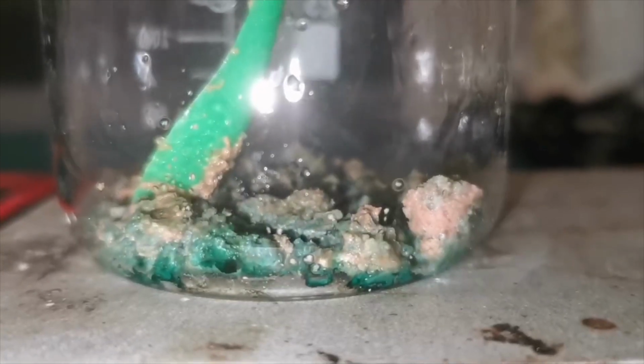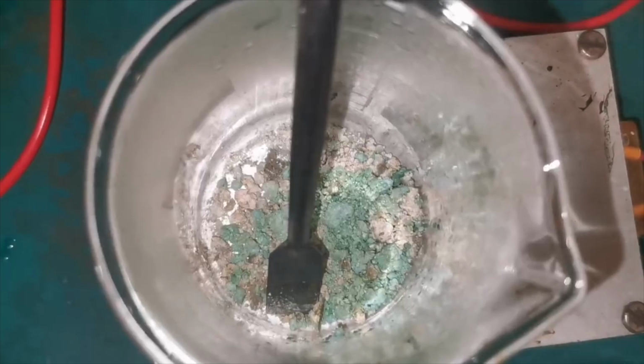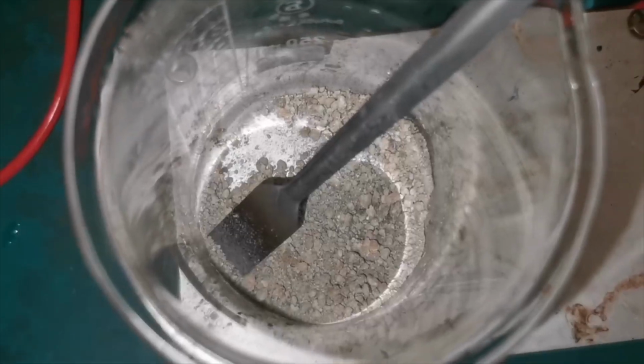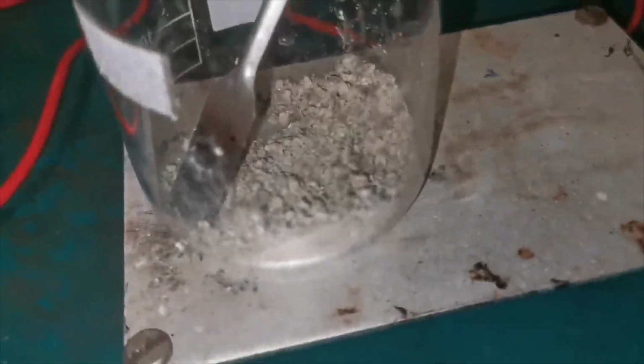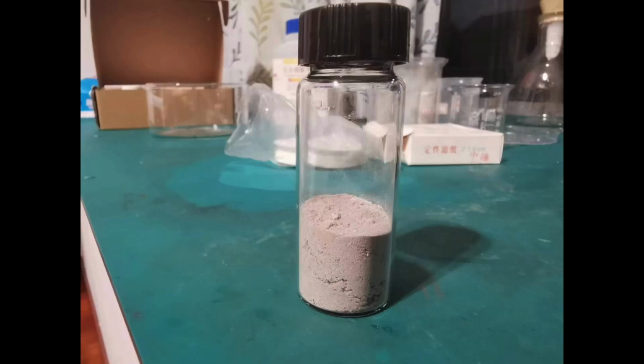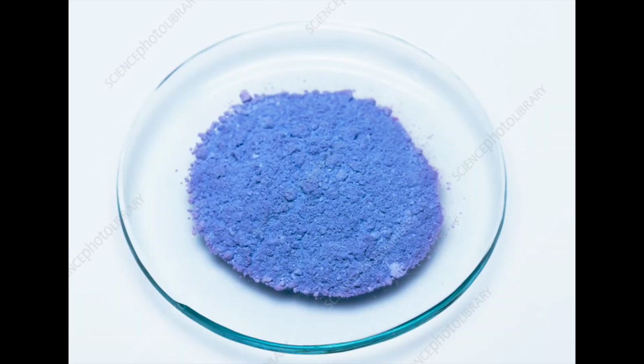As the crystals lose water, their color slowly changes from pink to green, and then a dirt yellow, and finally gray. After no water vapor was seen to be given off, I bottled my product, which has a slightly pink tint in its grayness and weighs 6.89 grams. However, real anhydrous cobalt chloride has a vibrant blue color instead of the gray color here, so there must be still some water not removed.